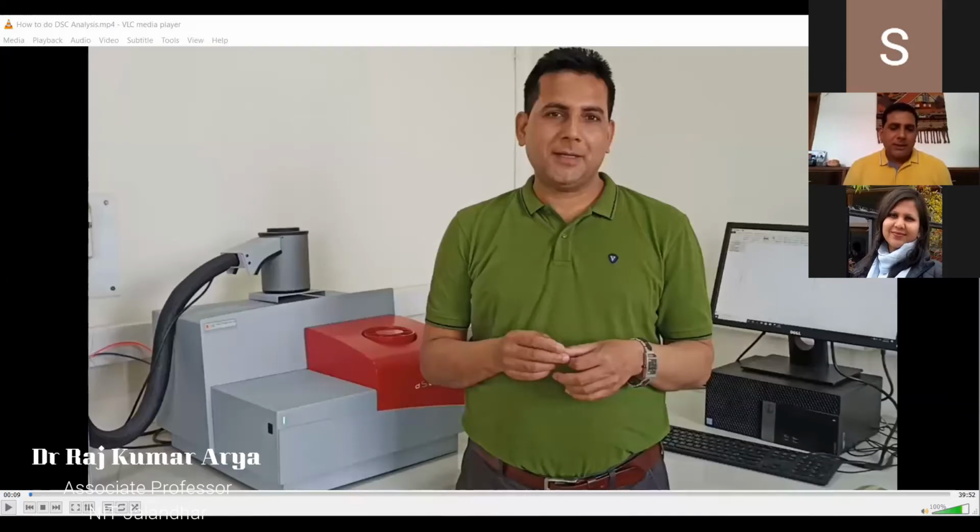Actually here I will explain how you would load the sample and how you would prepare the sample, because that is the most important part a student or any researcher needs to do. You should know everything on your own, so that if something is going wrong, you are in a position to identify what is going wrong. You cannot be completely dependent on the lab attendant or technicians.